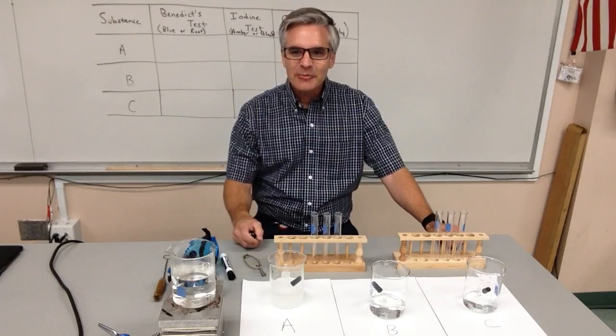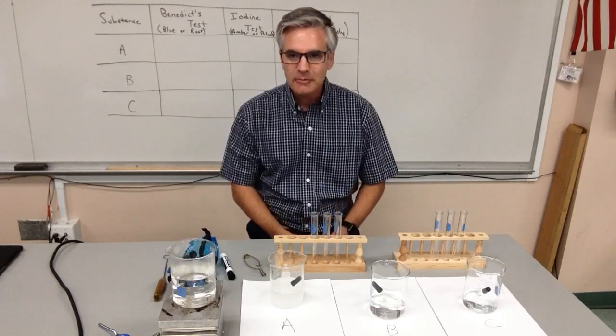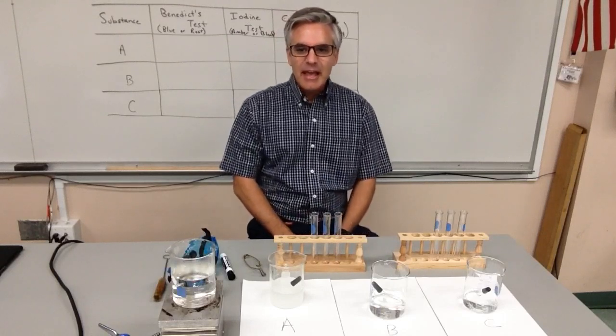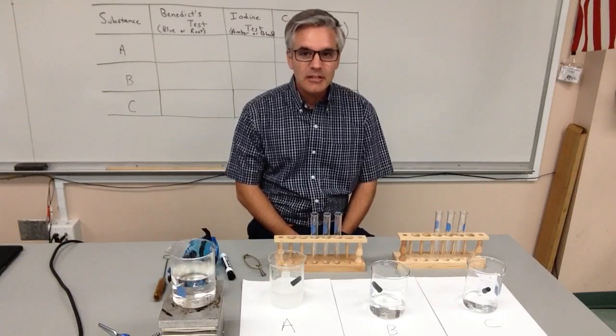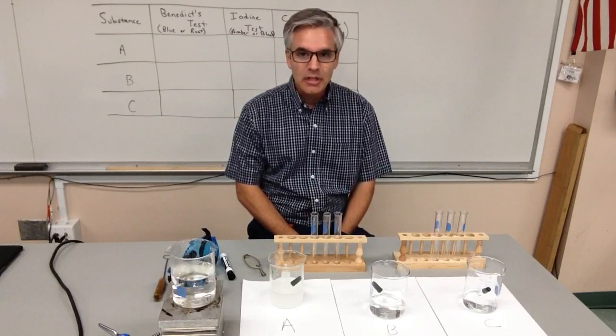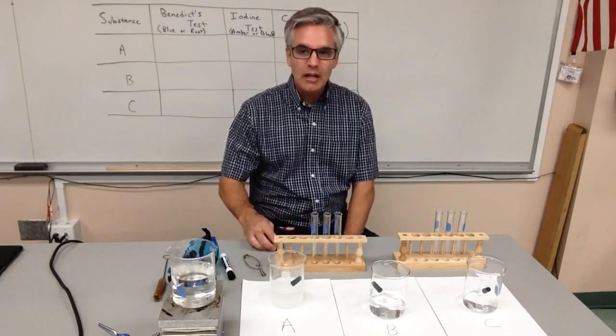All right, hello everyone. We are here to do the Identifying Carbohydrates Lab, and so again, I'm just going to model that for you, and we're going to go through it step by step. Your job is to do the write-up according to the lab report format sheet that you can find on the module. There's a little button there for it, or you can also find it back in the Unit 1 notes and handouts.